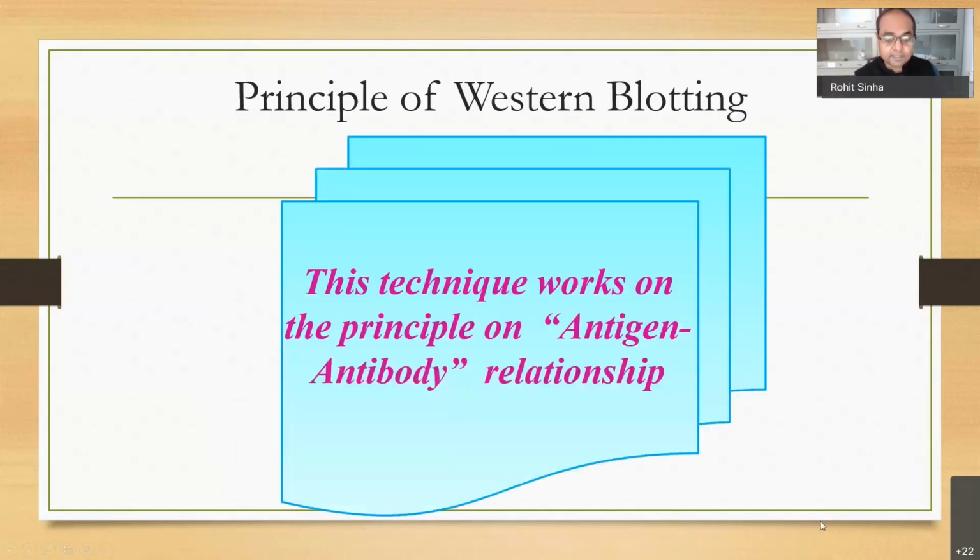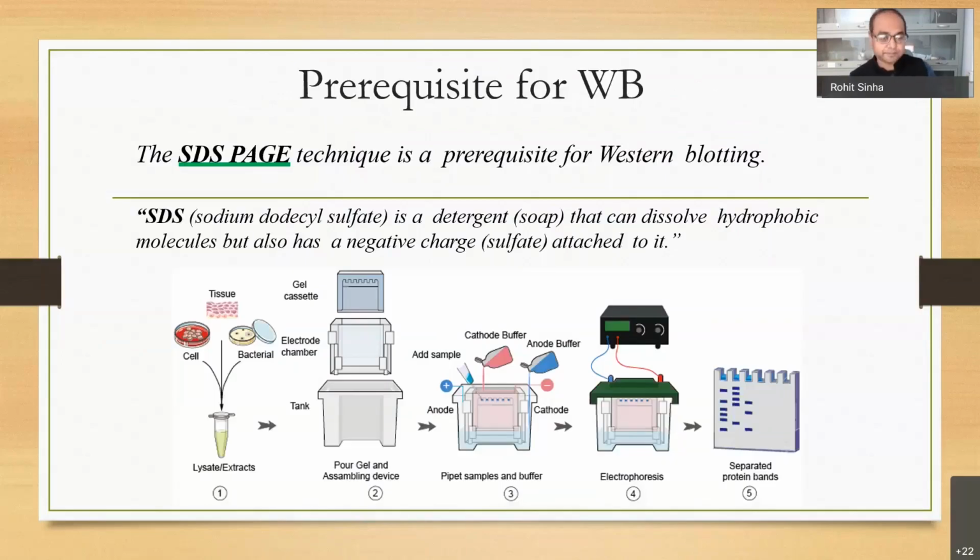One of the techniques which is still going on and probably will go on is almost a 30-year-old technique. It is not becoming automated, but it is still much used in all of the basic science papers you see nowadays in big journals. In all the journals, if you have to show relative expression changes or your knockdown efficiency, you have to use this technique known as Western blotting. Unlike its other cousins, Southern and Northern, this is still a happening technique.